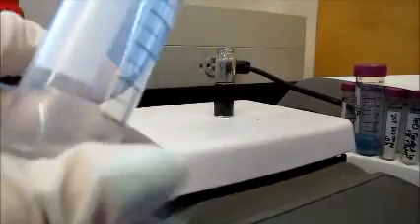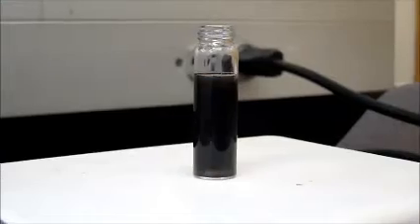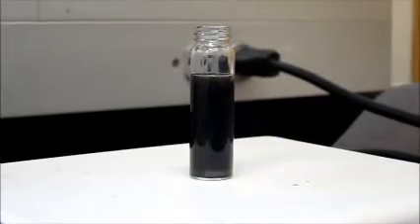followed by 1 milliliter of 1% cadmium nitrate. This reaction will take an hour to stir.